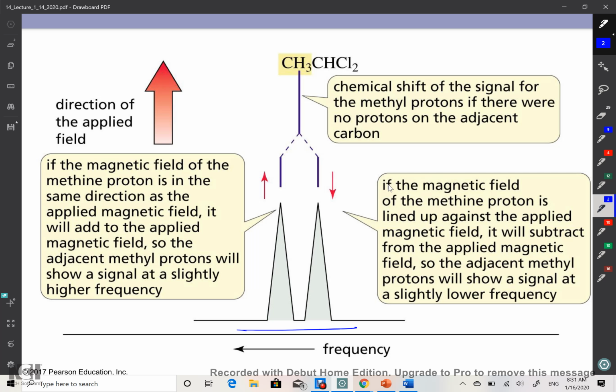So in this case, we are putting together 2 types of nuclei. Remember, NMR has to do with the nuclei, the spin of the nuclei. Okay? And so, signal 3, here, let's use only one of the protons in signal 3. And we have only 1 adjacent hydrogen to signal 3. Okay? So we are looking at 2 types of nuclei over here. And so, when you apply the magnetic field with those 2 types of nuclei, one of them could be aligned.